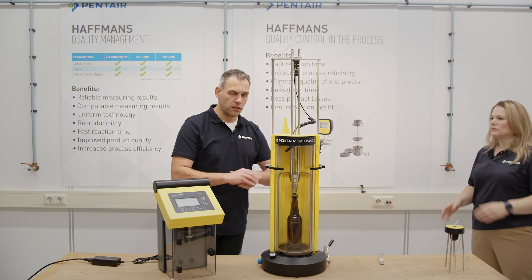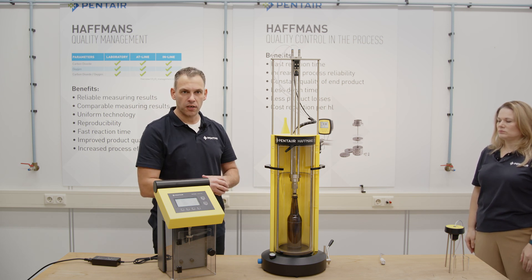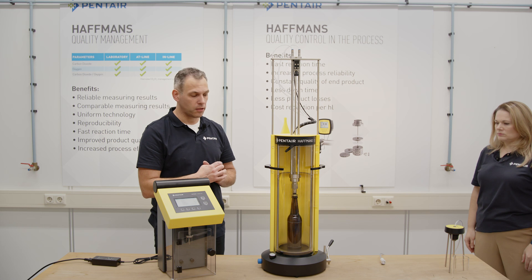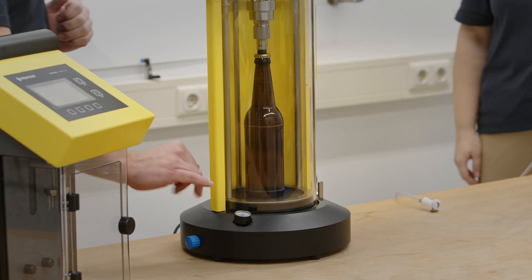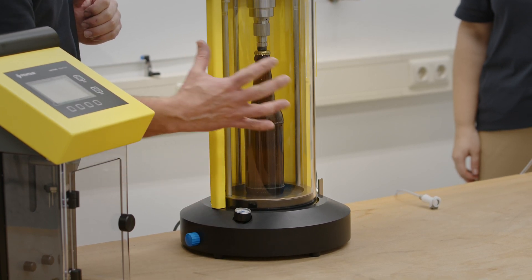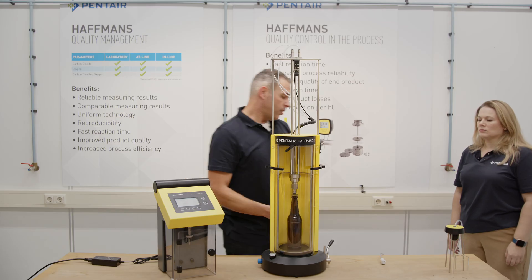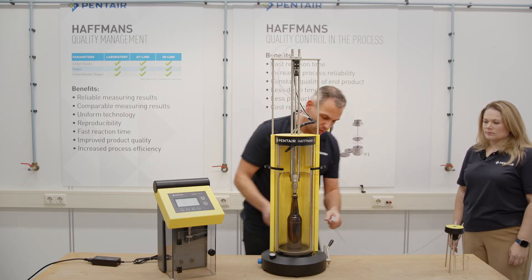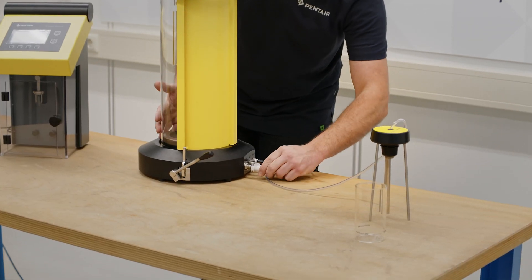We connected the ISD as we mentioned before. We are putting 6 bar CO2 pressure in the main supply, and the reduced pressure we adjust to 3 bar, because the bottle has a more or less 2 bar equilibrium pressure. The next step is to connect the FlashAhead to the sampling connection.